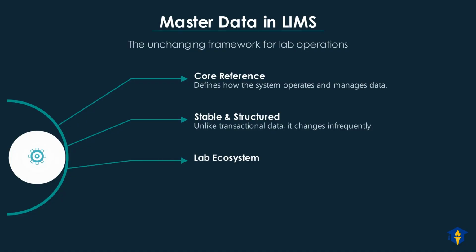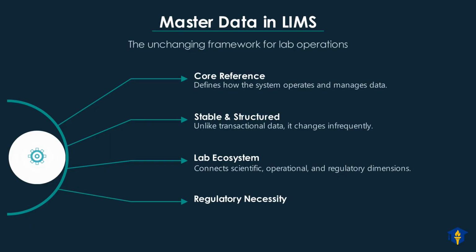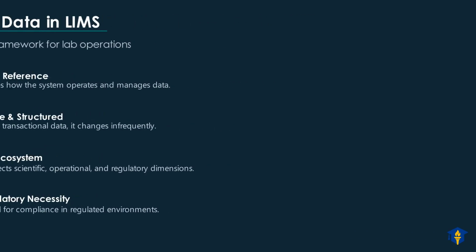Master data connects various dimensions of the lab ecosystem, including scientific and operational aspects. It also integrates the crucial regulatory dimensions, ensuring comprehensive data management. In regulated environments, master data management is not optional. It is a regulatory necessity. Proper master data is critical for achieving and maintaining compliance with industry standards.